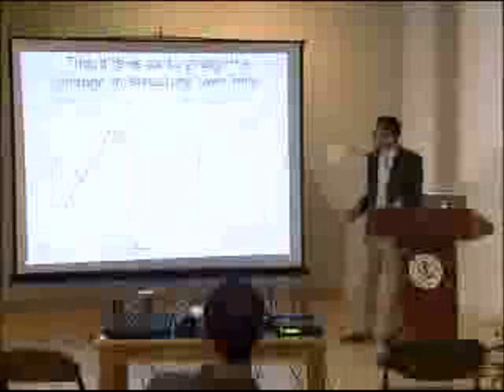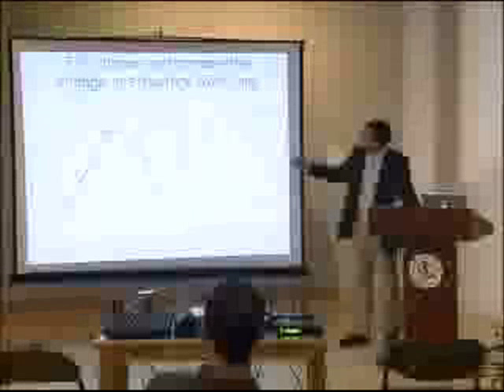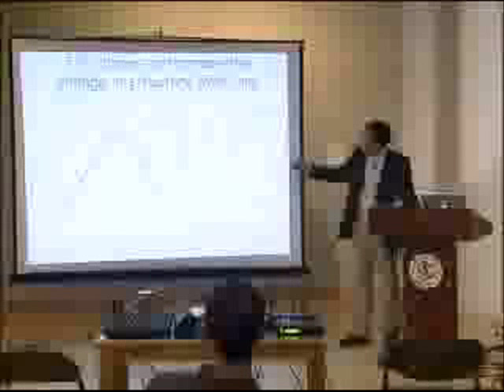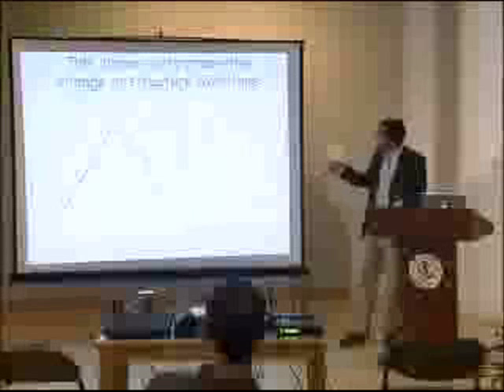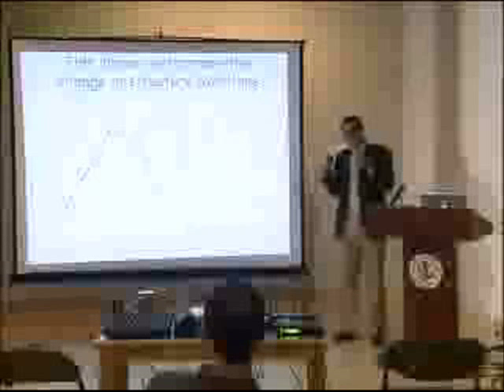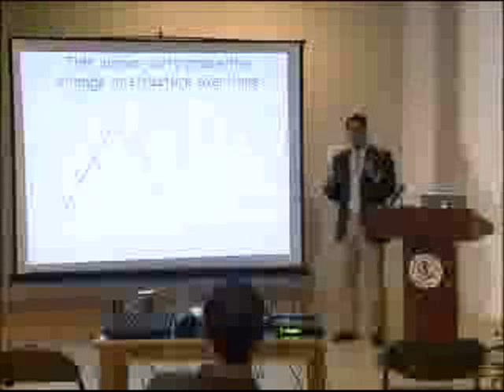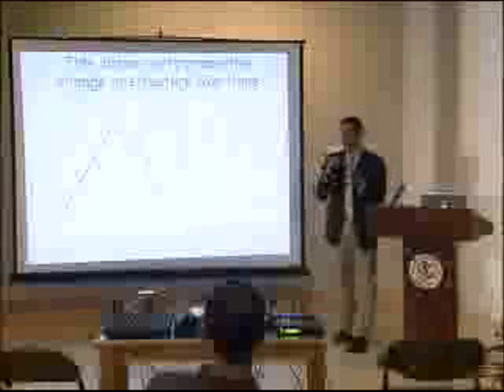So Lauren did this experiment. She started with a protein in its folded state, measured the IR spectrum, and she saw one peak disappearing. This peak is getting smaller, one peak getting bigger. This is the native protein disappearing. This is the aggregated protein growing in. And she could measure how fast that's occurring by looking at the growth of this peak over time. And that gives us an idea on a molecular level, how long does it take for these molecules to begin to assemble and aggregate.